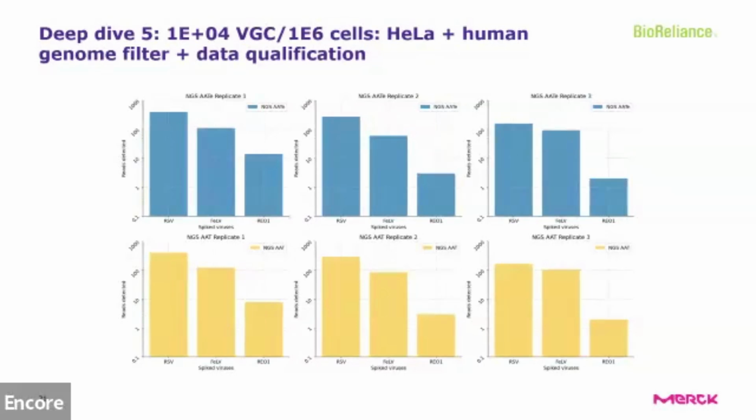I also want to mention that, of course, we update our database every 2 months. So we actually increase our genetic diversity every 2 months. And the more genomes in our database, the better K-mer is becoming, of course. So if we would have done this 15 years ago, I think K-mer would not have worked. It really needs the genetic diversity.